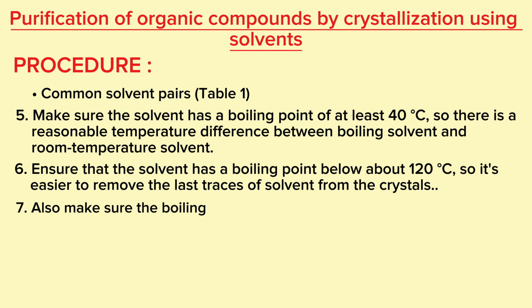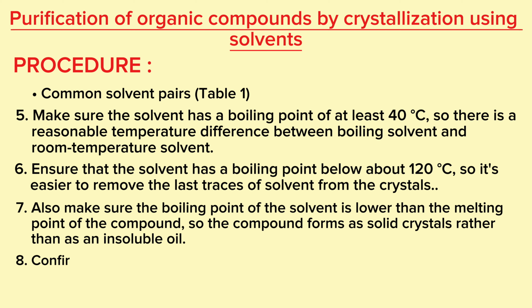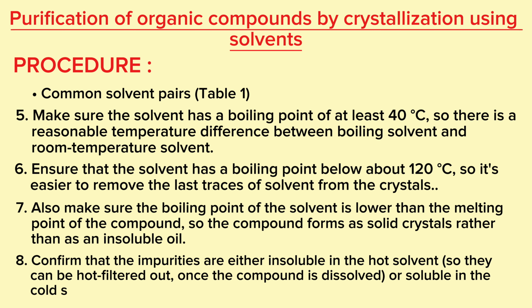Also make sure the boiling point of the solvent is lower than the melting point of the compound, so the compound forms as solid crystals rather than as an insoluble oil. Confirm that the impurities are either insoluble in the hot solvent, so they can be hot filtered out once the compound is dissolved, or soluble in the cold solvent, so they stay dissolved during the entire process.